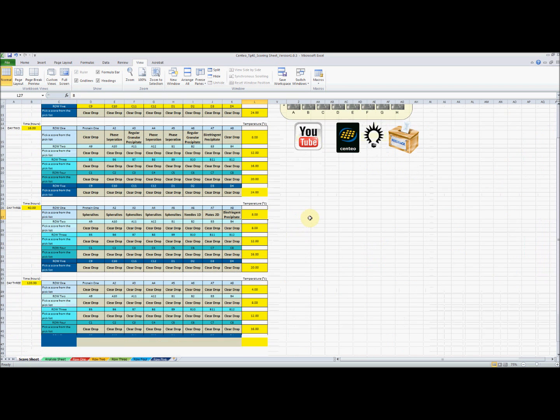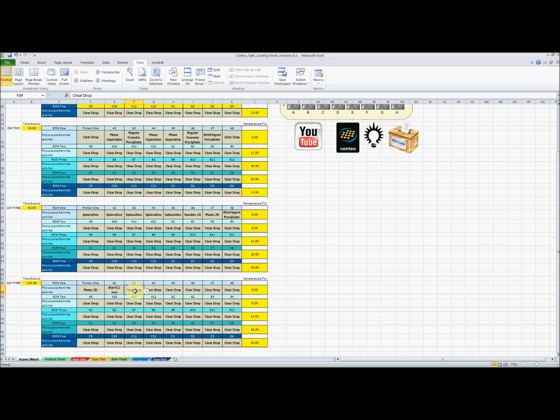Now let's complete this experiment, and let's say at 120 hours, again, that's an editable region, but let's assume I came back after 120 hours. Sorry, not I'll score it, I'll put the temperature in. And now I'll score it. It'd be nice if you got all this, but let's see. I'm going to score them all pretty high, because then I'll show you how we can quickly eyeball and see which are the most successful.